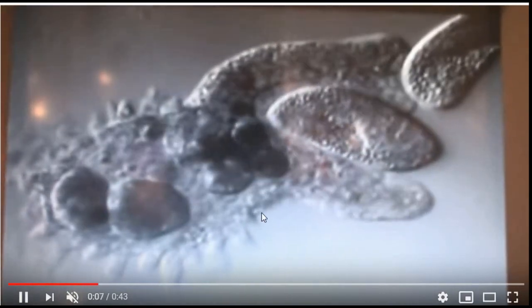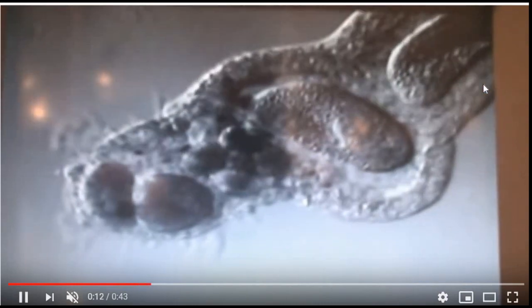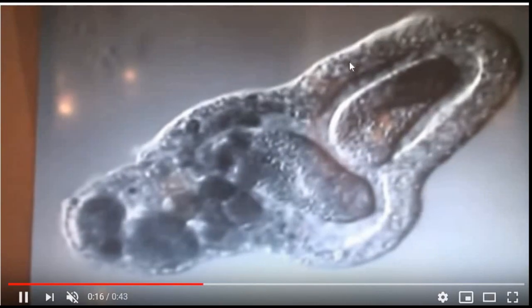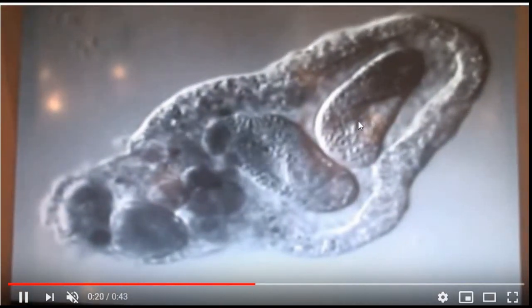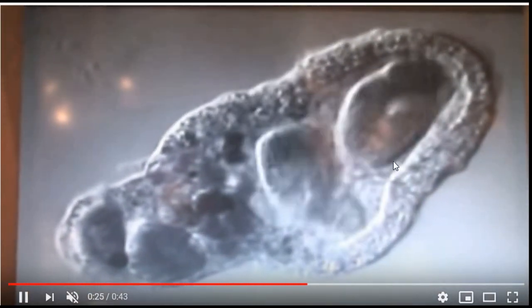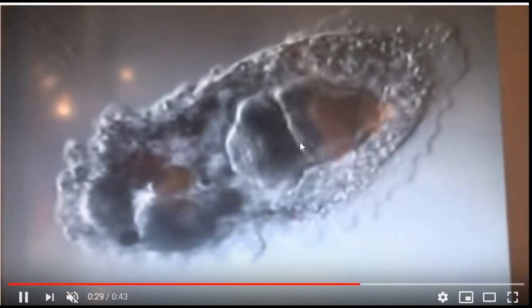So you can see here, we've got a cool video of an amoeba that's eating a paramecium. This can be viewed under a light microscope, and you can see the pseudopods of the amoeba, the bits that stick out, which are branches of the cell membrane. They will surround, and then they will engulf by phagocytosis, as you've learnt for white blood cells at GCSE. And then you can see this little paramecium squirming around on the inside, because it's going to be broken down. There are enzymes inside here breaking down the paramecium and killing it off, essentially having it for lunch.